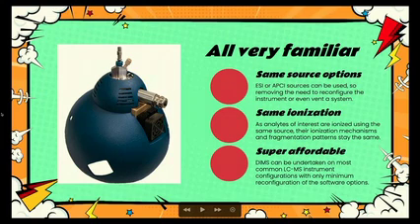Potentially there's no requirement to buy anything for your system. At most you might need a union to connect one side of the column oven to the other, to account for the fact that there's no column in place. So you can get away with a very, very low cost modification of your existing instrumentation.